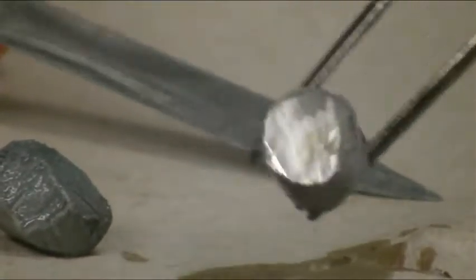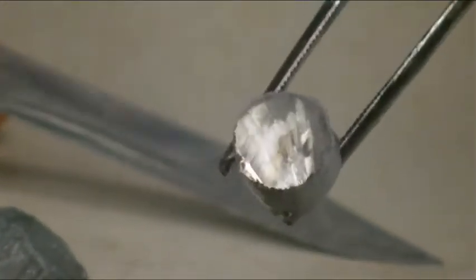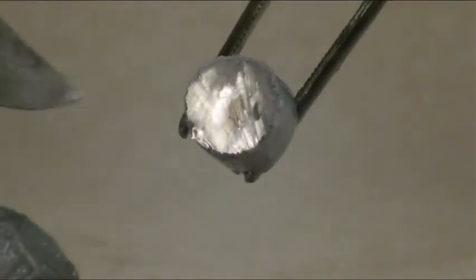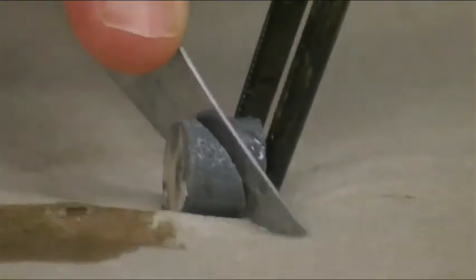And then what you can see here is it is extremely shiny, just like you would expect metal to be. On the outside here, it has oxidized a little bit. It means it's reacted with the things around it. But as you see, the fresh cut shows you that shiny metal characteristic that you're looking at. So this one isn't particularly very fun and reactive. It just takes a long time to react. So I'm going to cut this down into a little bit of a smaller piece here. And we are then going to toss it into some water and see what happens.